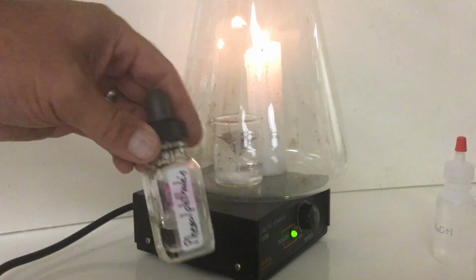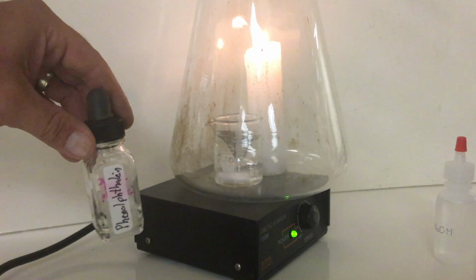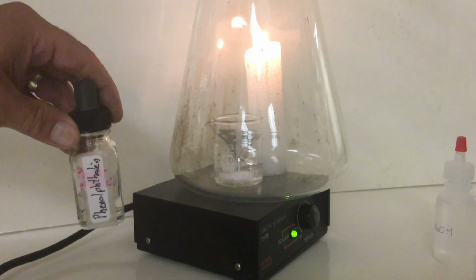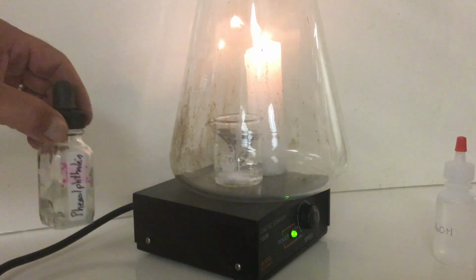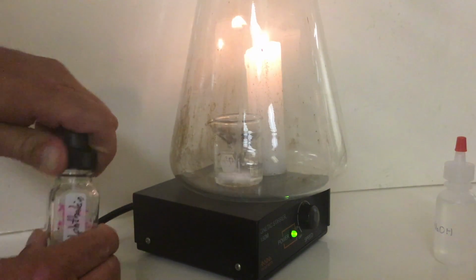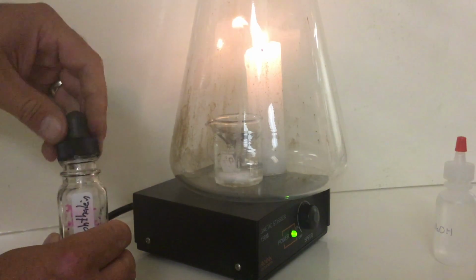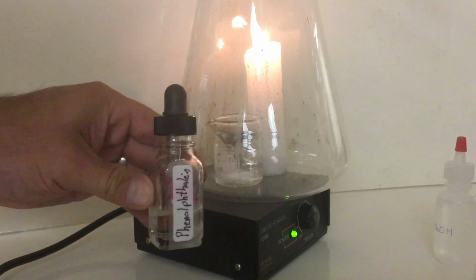Then I'm going to add another chemical, and this is called an indicator. What indicators do is they tell us by color of a liquid, of a chemical, whether the chemical is acidic or basic. And so we can tell if this chemical is an acid or a base by the color. And this specific chemical is called phenolphthalein.